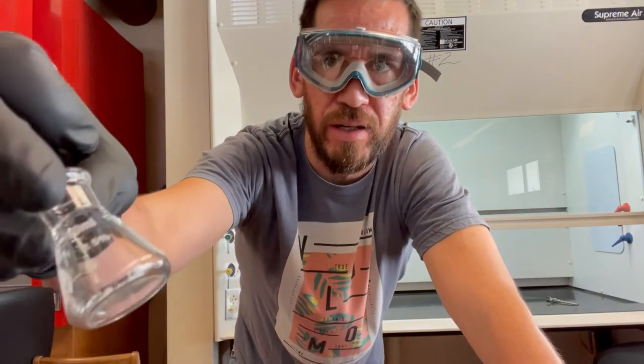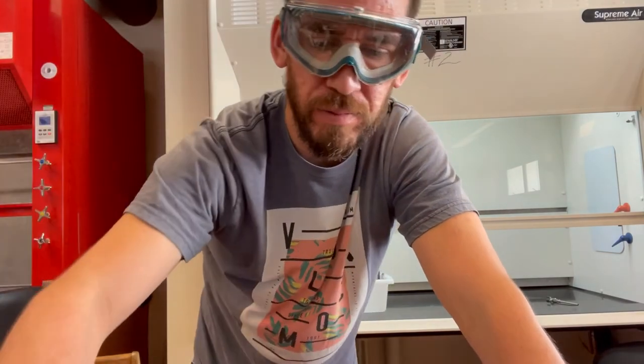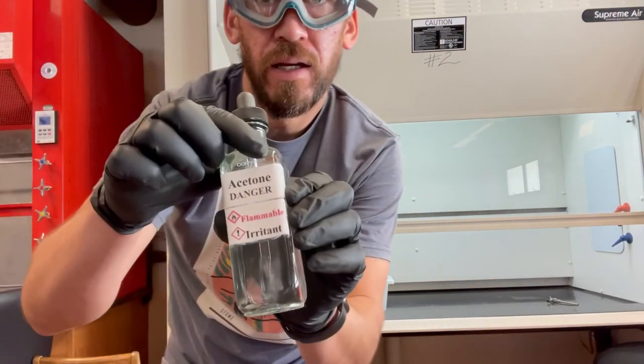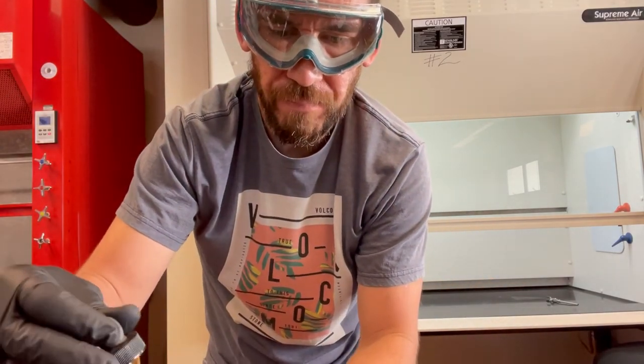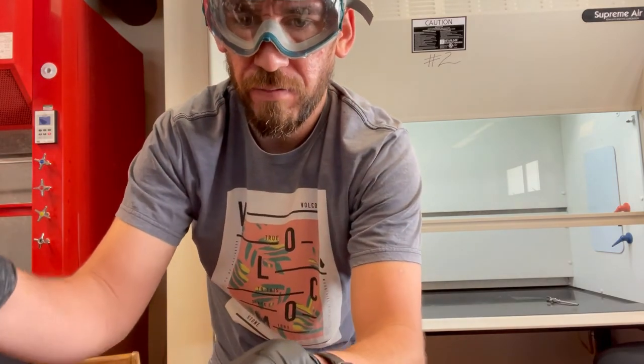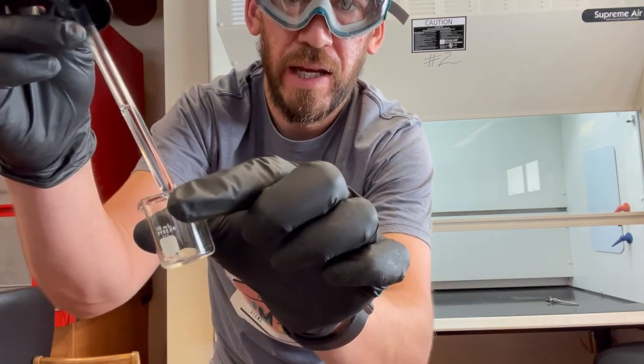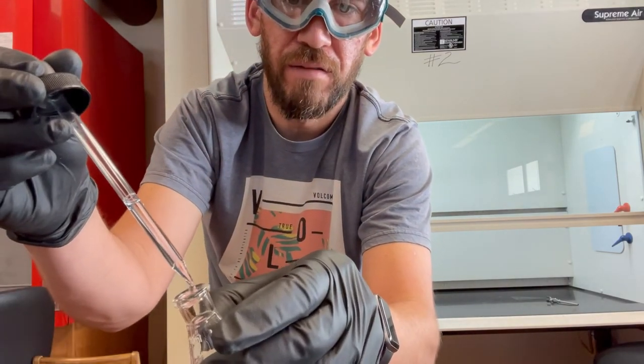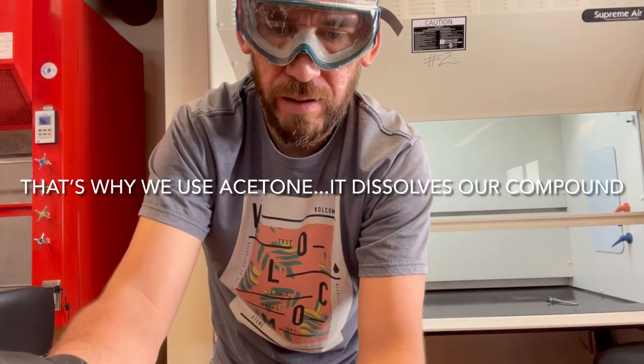Now, it's time. What I did was I scraped a little something inside of this beaker and this flask. The flask is the weird colored one, the orange drink, and the beaker is the normal, yellow looking one. Of course we need to add a couple drops of acetone to dissolve it, just enough to dissolve that, and it won't take much. It does evaporate quickly, so maybe I'll add a little extra drop in there.